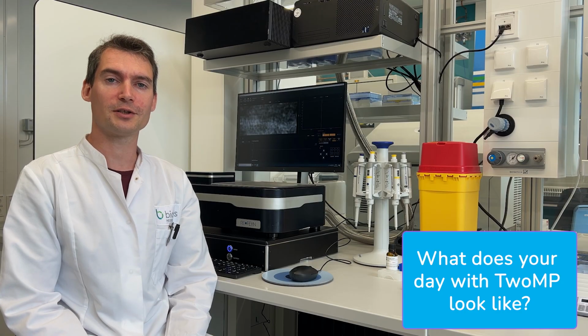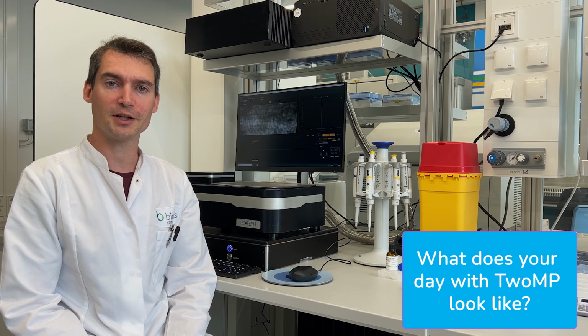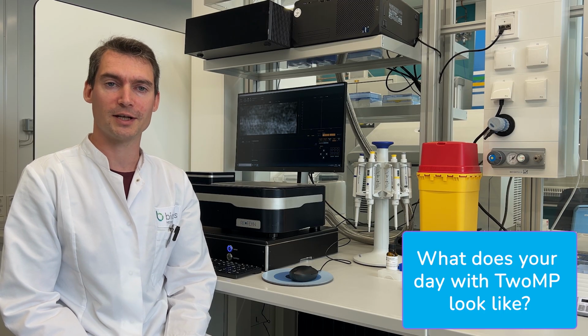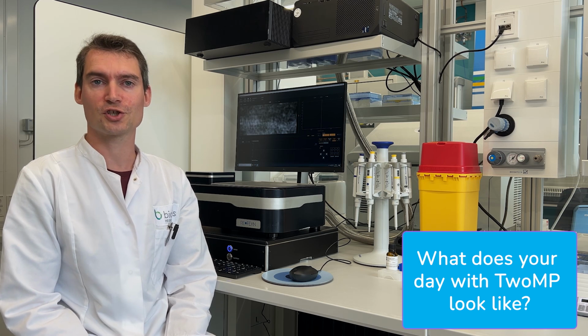If the sample doesn't look good on the TwoMP, this is the point where we start purifying it in another step using size exclusion chromatography, after which again I like to analyze the single peaks that came out of the column with the TwoMP due to its higher precision.